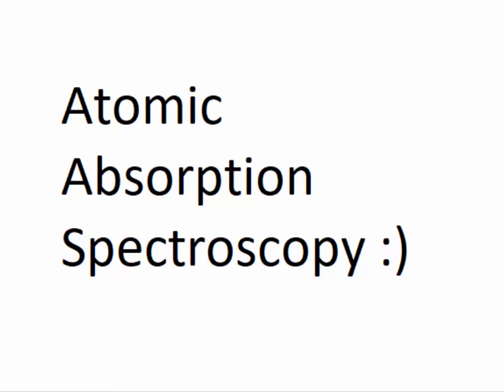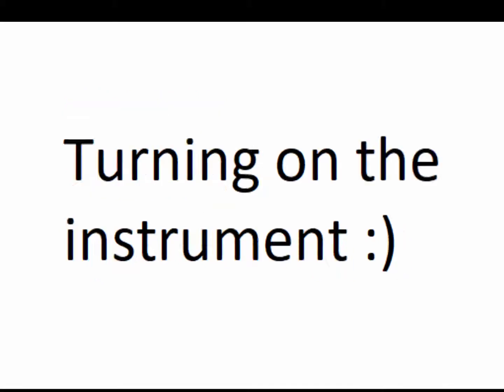Hello, and welcome to Atomic Absorption Spectroscopy. In this video, we'll learn how to turn on the instrument, the flame and lamp, changing methods, testing samples, switching lamps, saving data, and then finally turning everything off. So first off, we'll learn how to turn on the instrument.